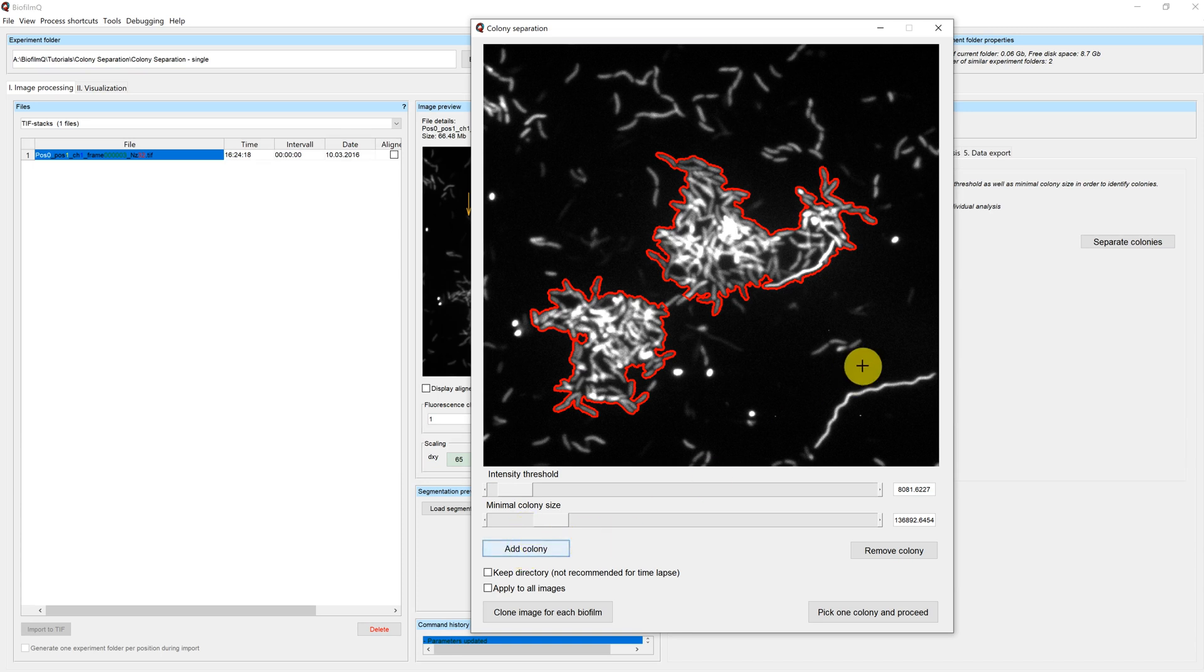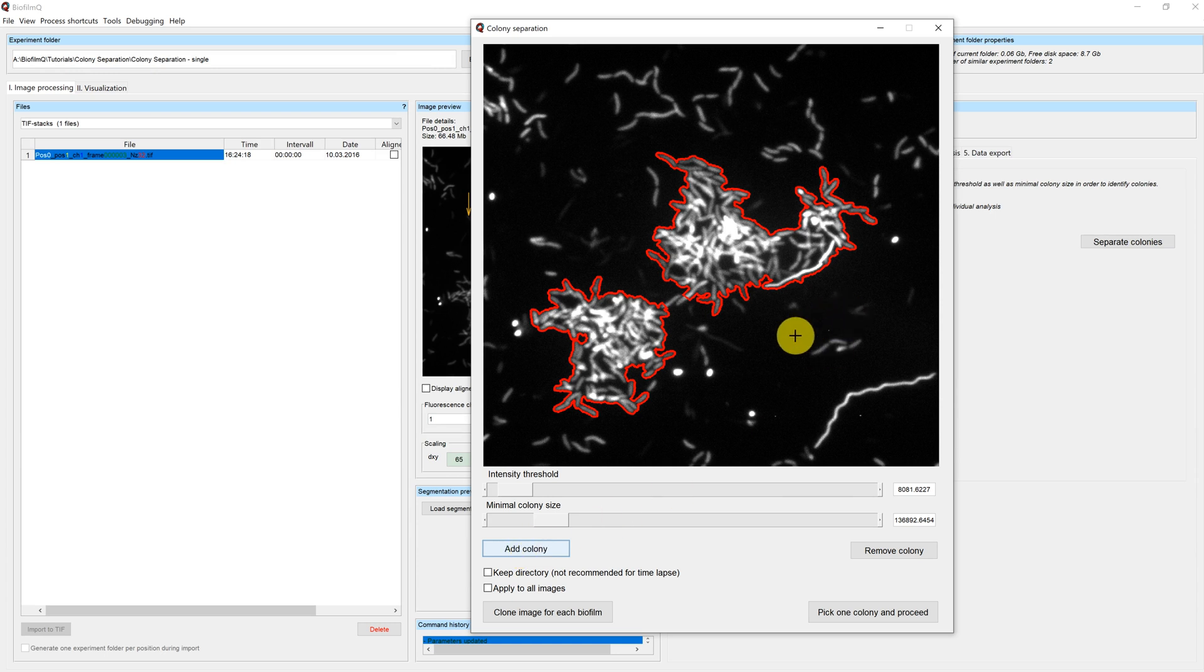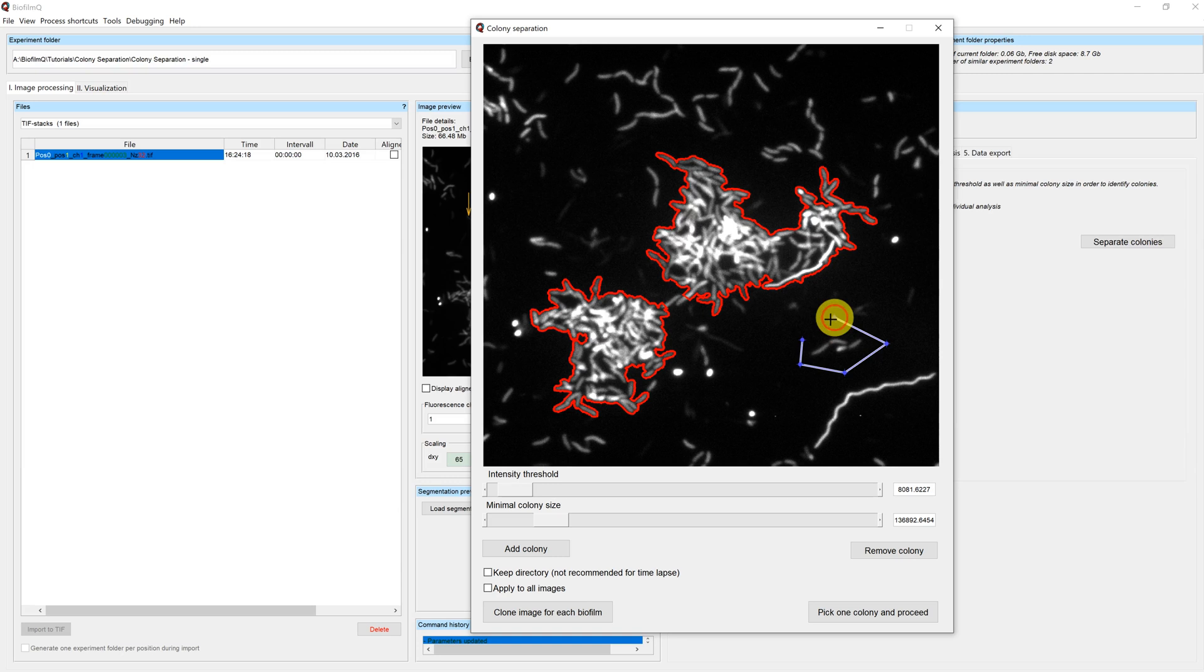In this case, we also want to add this small cluster of cells to our selection. We use the add colony button to select the area and double click to apply the selection.